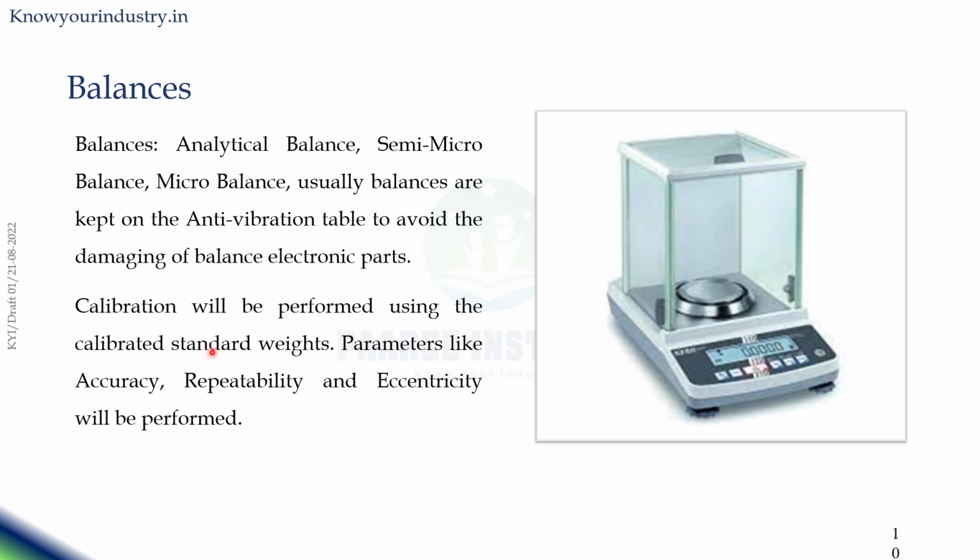The calibration of the balances will be performed using standard weights. Parameters like accuracy, repeatability, and eccentricity will be checked for the balances. The analytical balance, semi-micro balance, or micro balance are named based on the range which can be weighed by the particular balance.